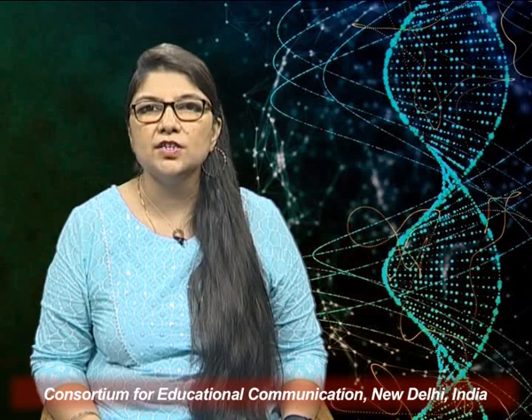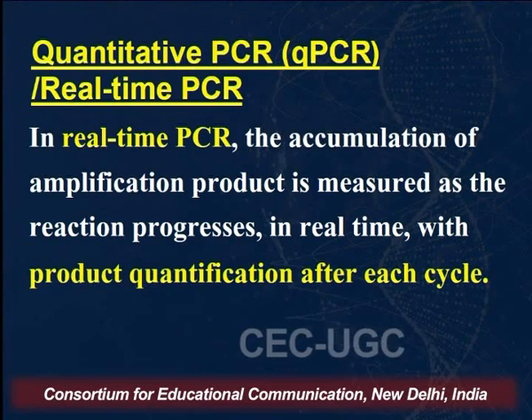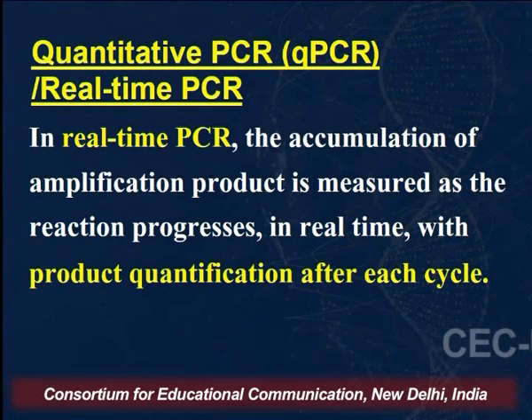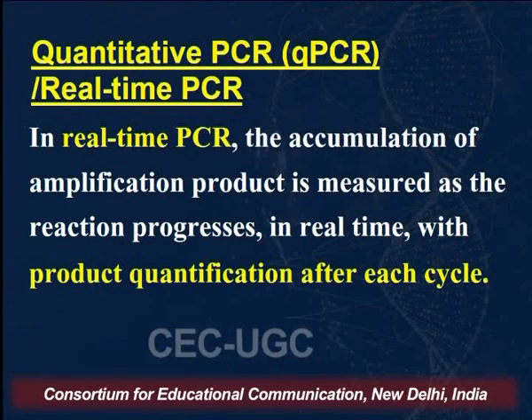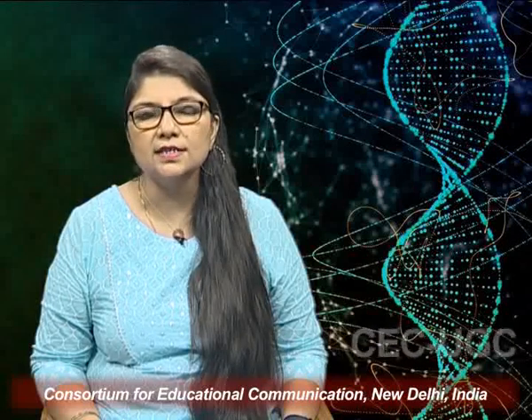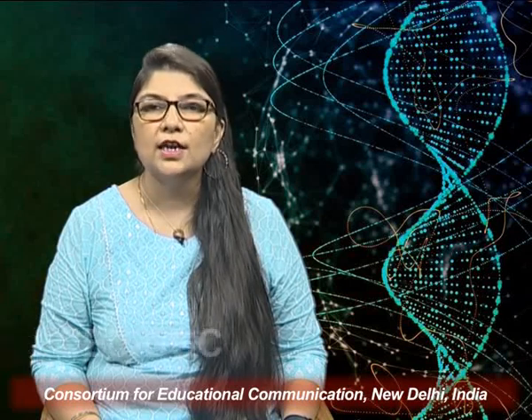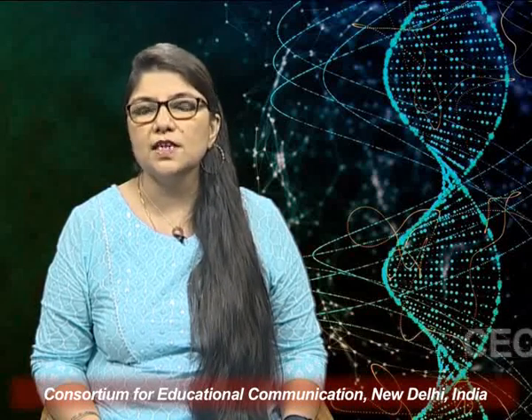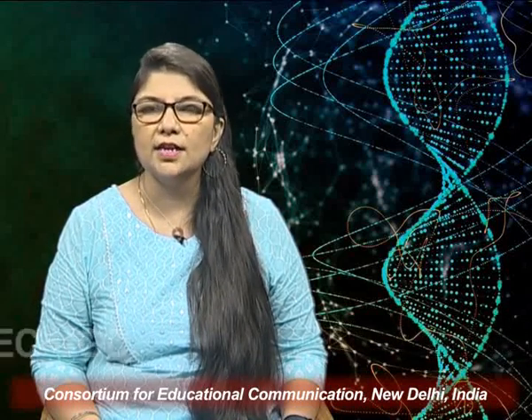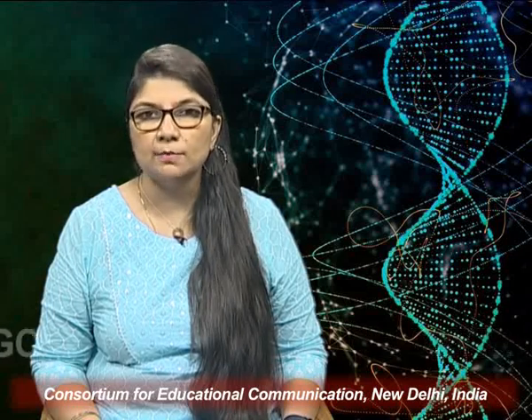But what happens in the real-time PCR? The accumulation of the amplification product is measured as the reaction progresses, that is in real time, with product quantification after each cycle. So, this is real time because as the amplification is happening, as more and more copies of DNA are produced, at each cycle we measure the quantity that is produced. So, it gives us an advantage because then the increase in the copy number can be correlated with the initial template that was present. So, this was a revolutionary technique that came into being.